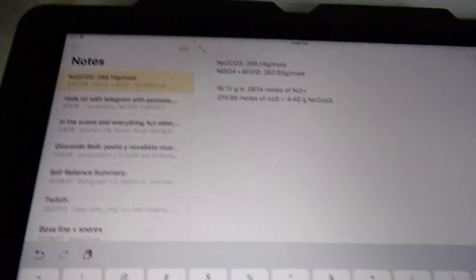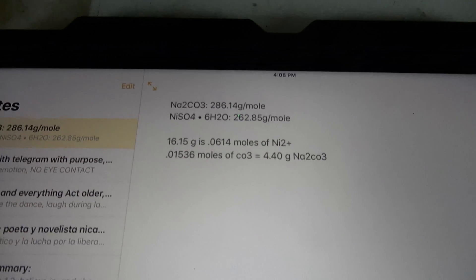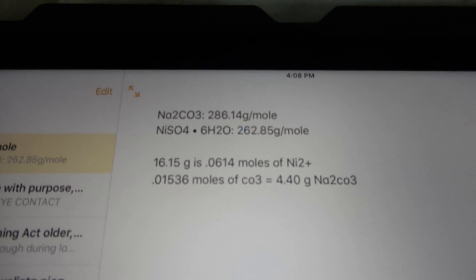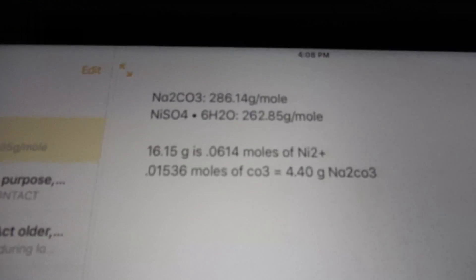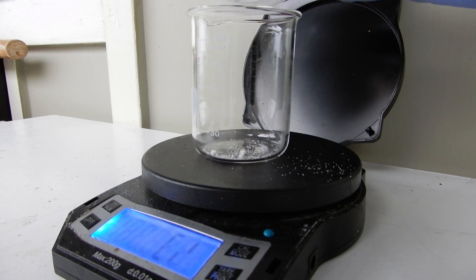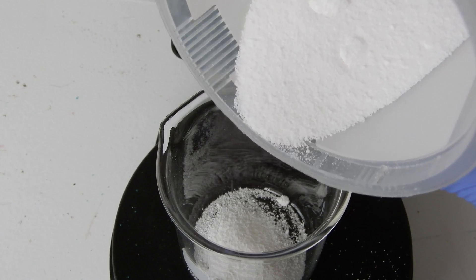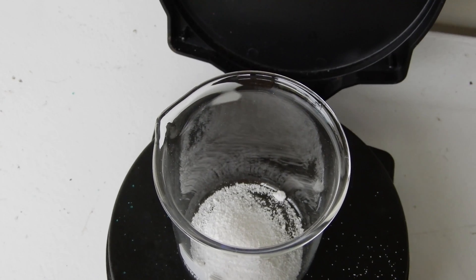Thunder's still roaring but I just did some more calculations and it comes out that I need 4.40 grams of sodium carbonate decahydrate. Yeah, that's the formula. I don't really want to explain it — just trust me. And then if our yield is low you can criticize me. Alright, 4.4 grams.